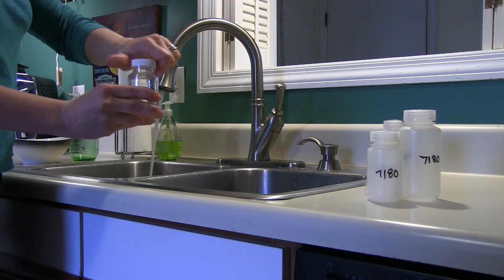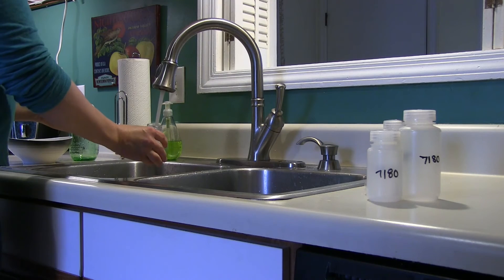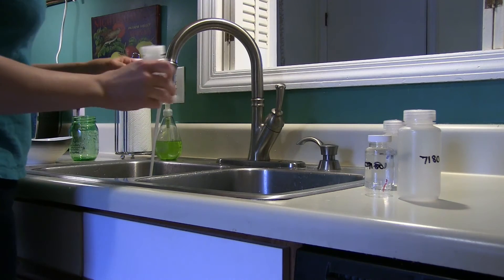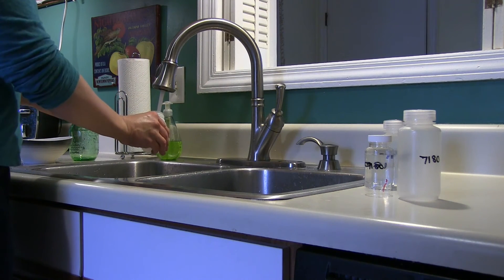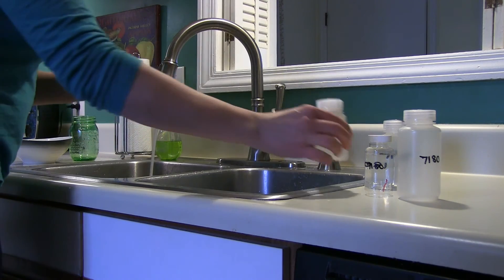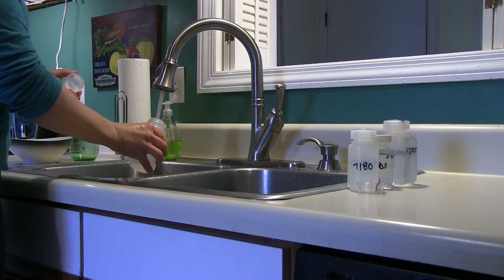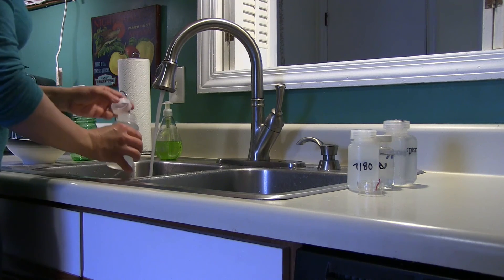After allowing the water to run for at least one minute, you will collect the rest of the water samples. The order in which you collect water in the rest of the bottles does not matter at this time. Collect one bottle at a time, holding the cap carefully in your hand and filling each bottle to the top, making sure the water does not overflow. Replace each cap firmly on the bottle once it is full. Repeat this process with the remaining three bottles until all bottles are full and the tops are securely tightened.